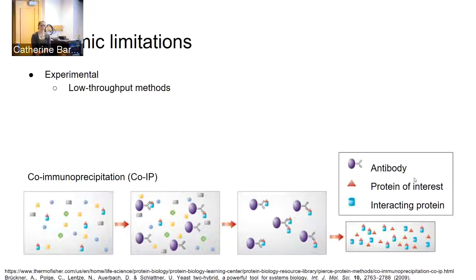And so this doesn't even require FRET. You just have to look at the cells under a fluorescence microscope and see if you've got polar localization. And unless protein B has intrinsic polar localization, which of course you control for by doing the same thing in cells that don't have the polar localized partner, you get a pretty good signal. So I suspect what we'll have to end up doing is something like taking a matrix of 30 or so proteins, some of which are supposed to interact and most of which are not, and run an assay like that and see what are both false positives and false negatives.